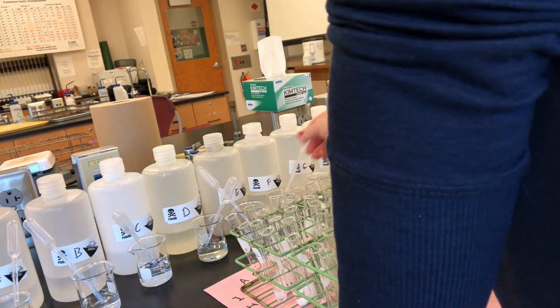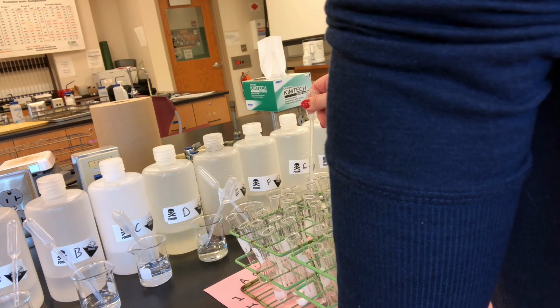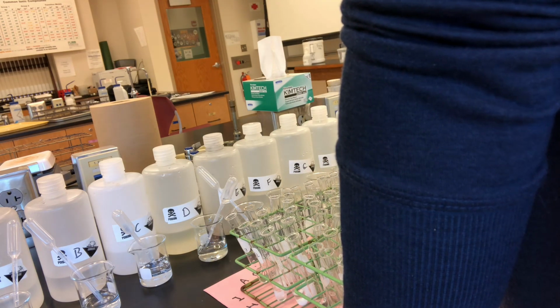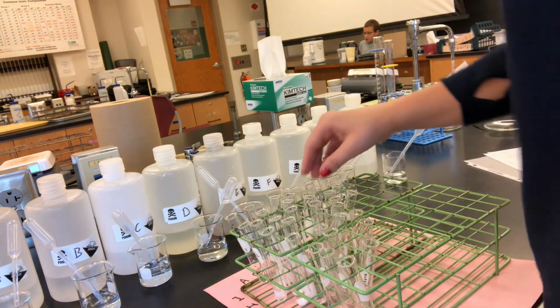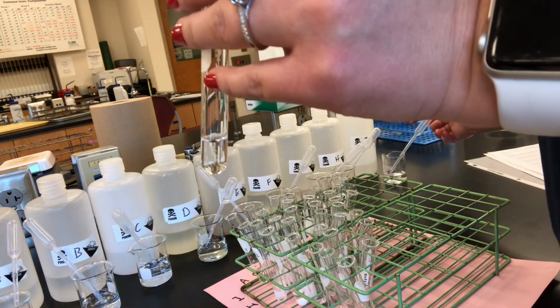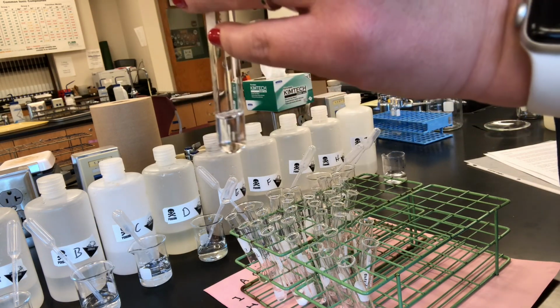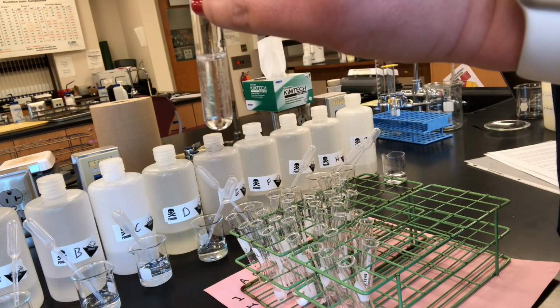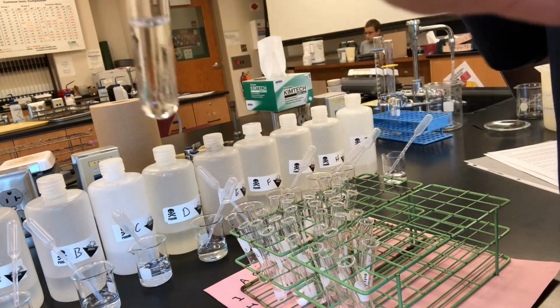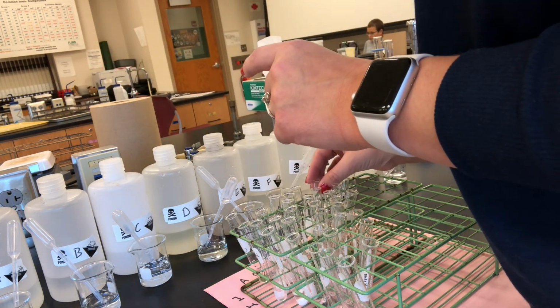All right, F. I'm going to go ahead and fill these three: F1, 2, and 3. So I've got F, and I'm going to add I. F and I: swirled a little bit, but no change. No precipitate formed.